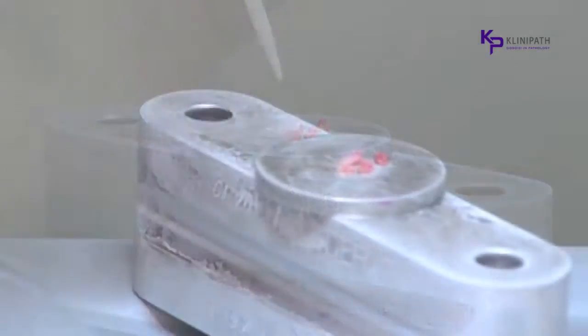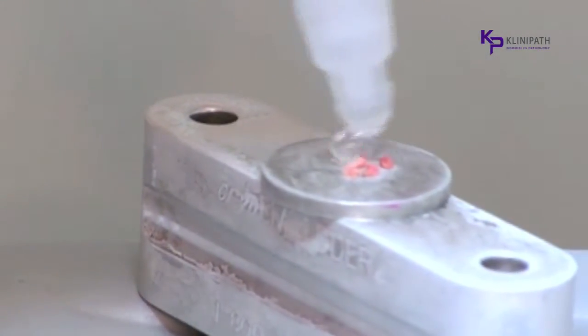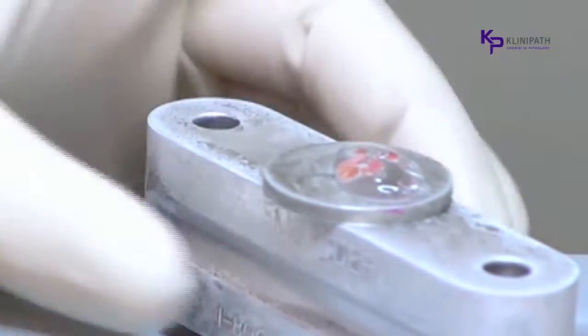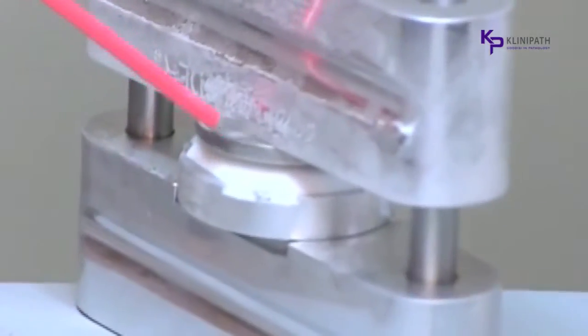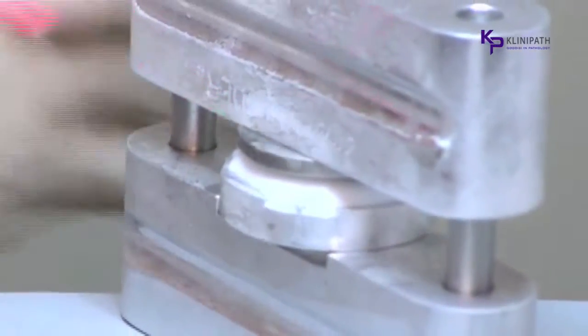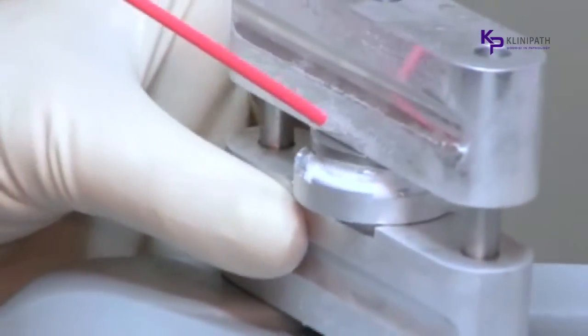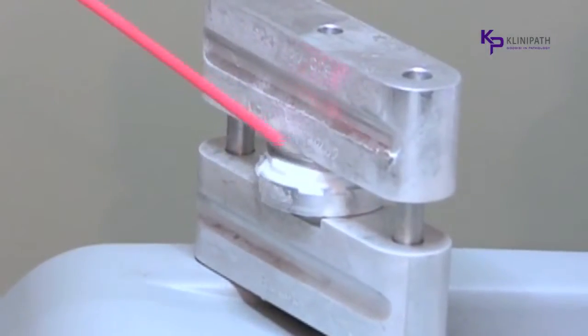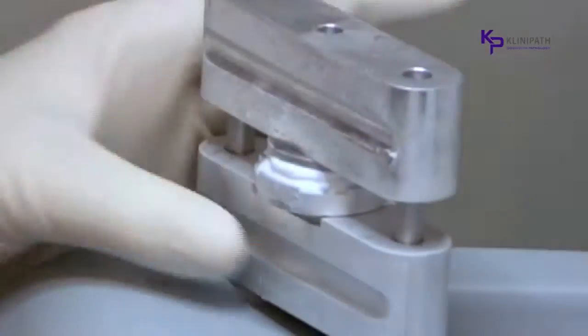This portion of the demonstration has been performed in real time to show the speed at which frozen section samples can be ready to cut. In addition to speeding up the processing time for the technician, the Cryoembedder provides the pathologist with more accurate slides that will show all of the pieces in the block on the same plane in each section placed on the slide. Precious tissue is spared, multiple sections can be cut on the same plane, and slides will be ready for the pathologist faster.